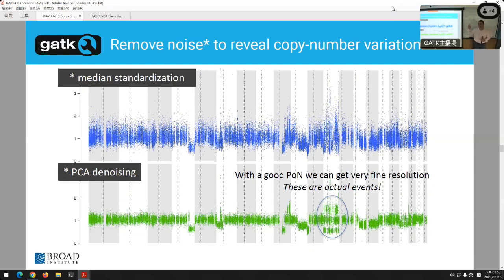Okay, you have 2 from your father and none from your mother. And that's why it's messy like this, and that's why we still have more steps to do. But this is what something like that would look like. Pretty cool, right? Scary, although that actually happens in tumors, but this is what you see.